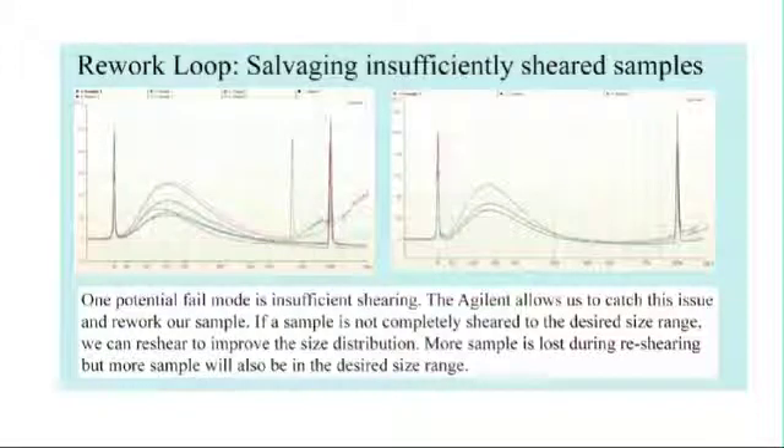In this image, we focus on how using the Agilent QC allows us to salvage samples that didn't shear well. When a sample shearing profile shows that the shearing was insufficient and the size range is too large, it's possible to shear it further. Some of the material from the previous image was placed back in the Covaris and re-sheared. While re-shearing doesn't always work perfectly, it does allow us to proceed with more correctly sized material than we would otherwise have had. This is especially helpful if there's no more unsheared sample remaining.